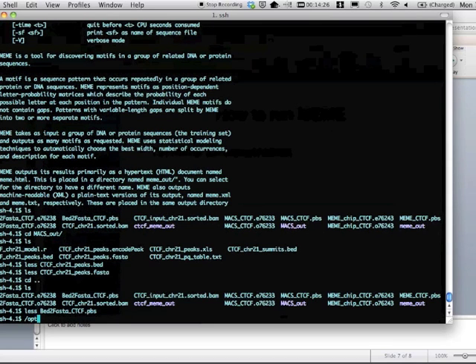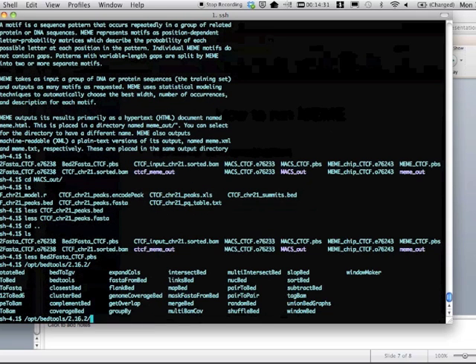If we go, we can look at all the other tools. Bedtools also has a ton of different options. So yeah, a bunch of different really cool tools in here. Intersect bed will tell you where all of your aligned reads are over a certain bed file or GTF file that you want to count. It's a good counting one. Bed to BAM, so you can just convert between different files, BAM to bed. This is a really good general toolbox to learn how to use some of these programs. Okay.